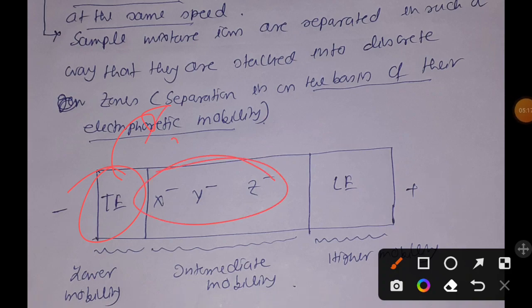That's how the separation is going on in isotachophoresis. The entire rearrangement depending on the differences in electrophoretic mobility continues up to a certain time, and after that there will be a period in which we end up with an equilibrium.